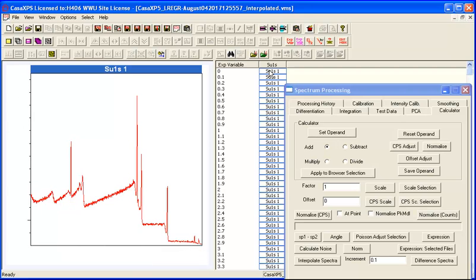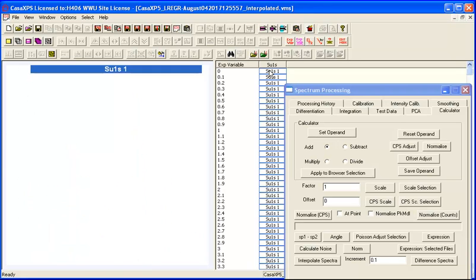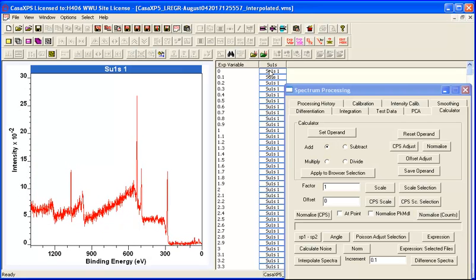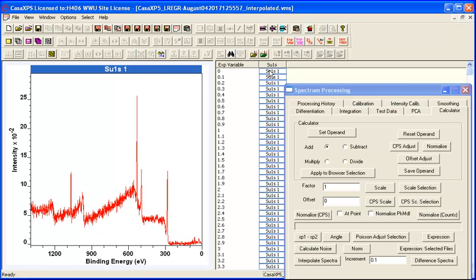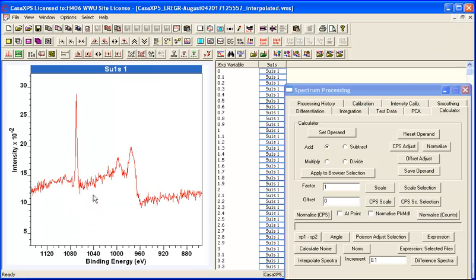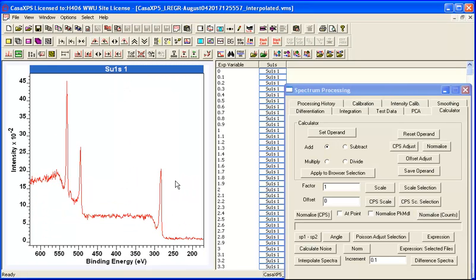So I'm working down the list and I'm looking for a spectral form that looks plausible in terms of spectroscopy. So the peaks shouldn't have distorted shapes. And what I would like to do is again use this within the calculation of a least squares from the original data set. So that's a sodium 1s. Let's see what these look like.